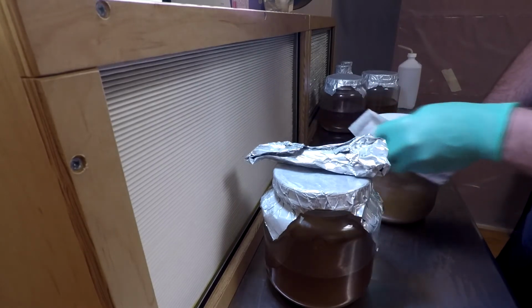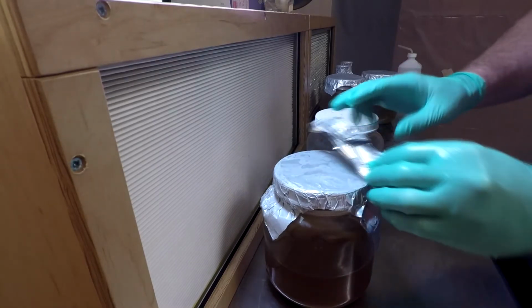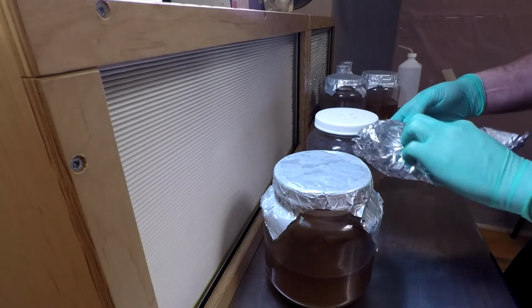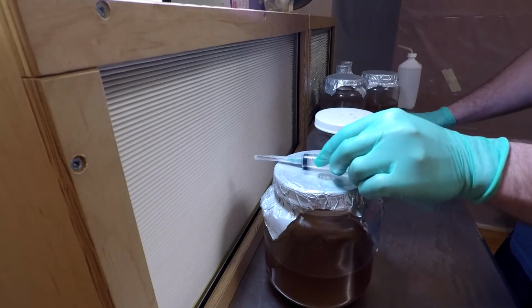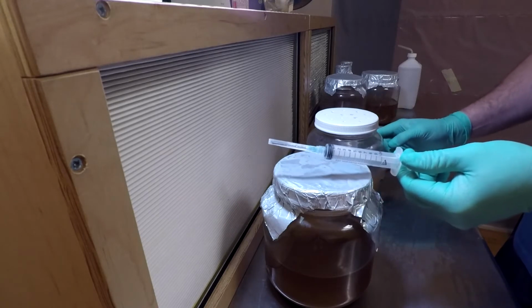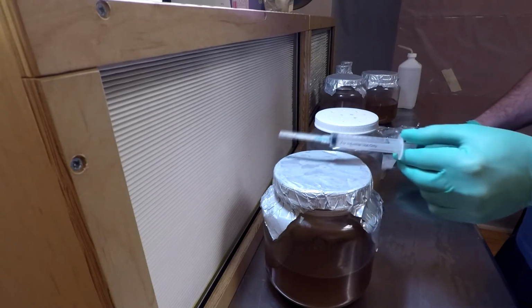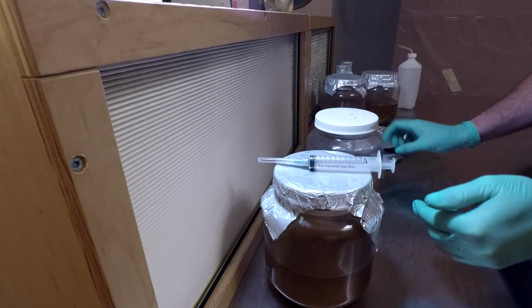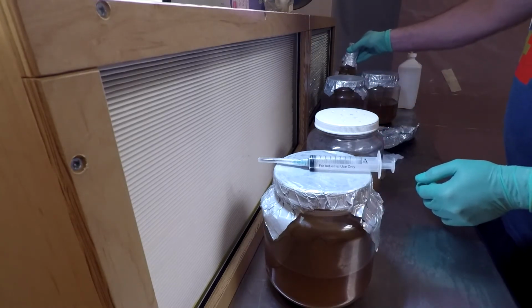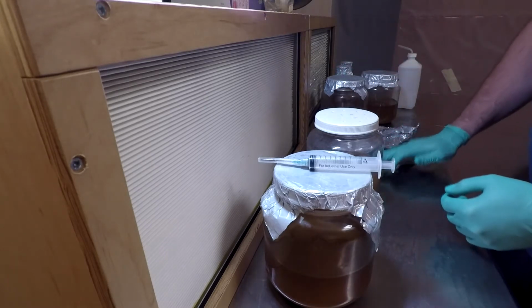So I've sprayed it well, I've wiped it down well. I have a sterilized syringe, and what I plan to do is to fill this up with some of this liquid culture and spread the liquid culture into these other jars. See, I have three other half-gallon jars, and then I got a few of these 500 milliliter Erlenmeyer flasks. Because I'm out of jars, I've got to get some more jars.